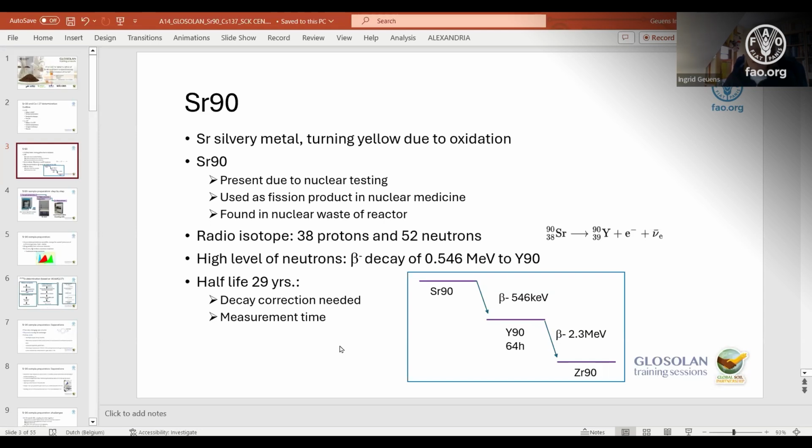For the rest, of course, we use a lab coat, we use protection for our hands, because with beta emission, the most important thing is that you don't take it in, that you don't take it home, that it stays in the lab. So that's why you have to protect your clothes. We sometimes also use overshoes, so also to be able not to bring it out of the lab.